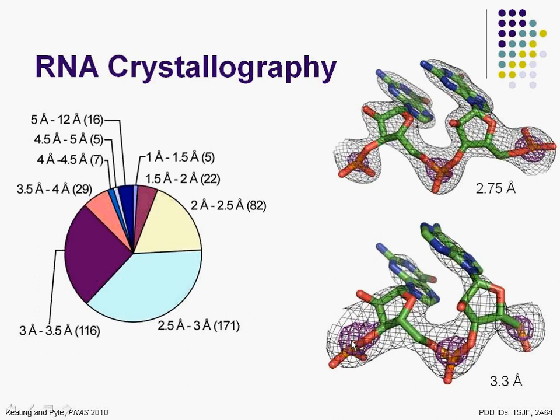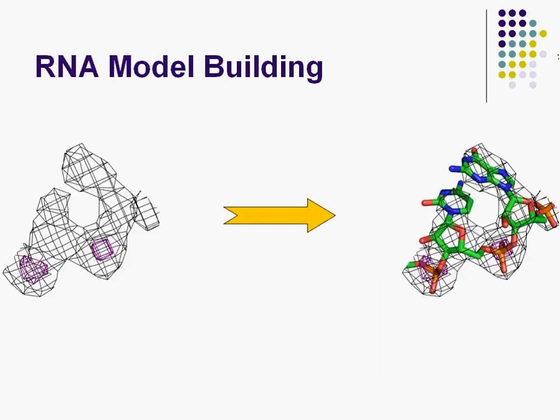The phosphates are nice and electron dense. They show up very well. The bases are large and rigid and planar, and they're the things sticking out of the density for the backbone. So phosphates and bases isn't too difficult, but getting precise positions for really anything else is incredibly difficult, time consuming, and usually not terribly accurate. You can see generally where the sugar goes, but trying to place the sugar itself precisely is almost impossible when you're just staring at the density.